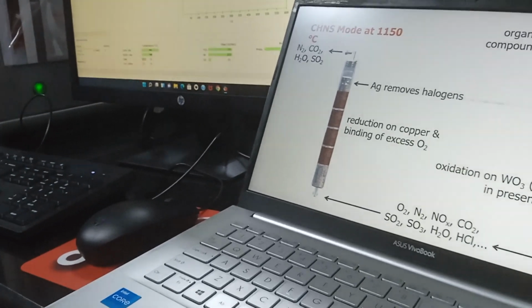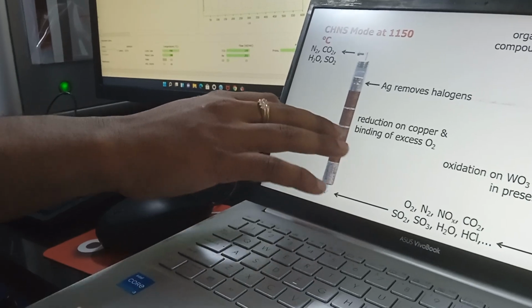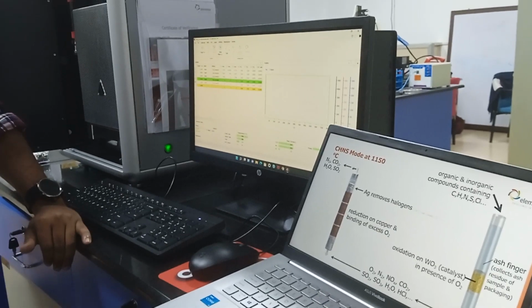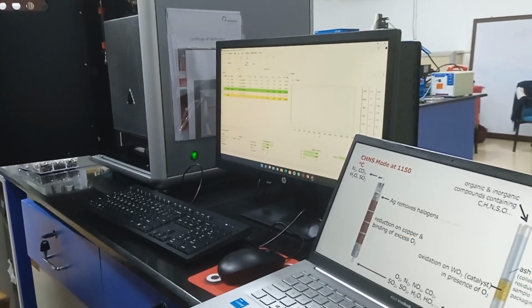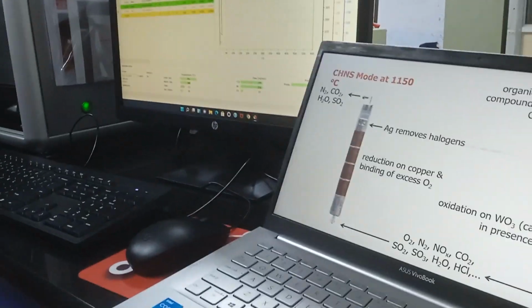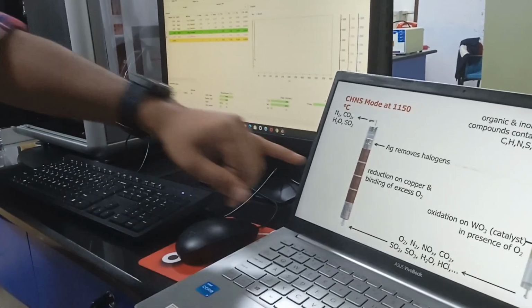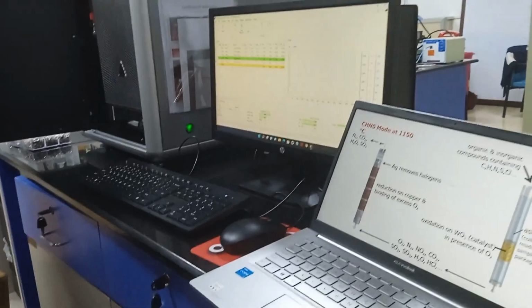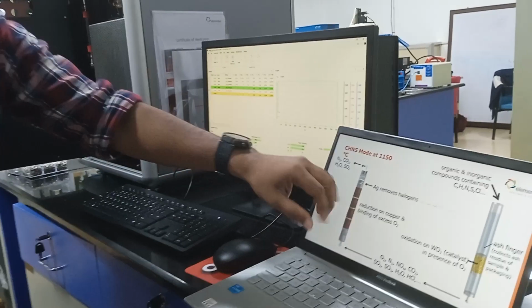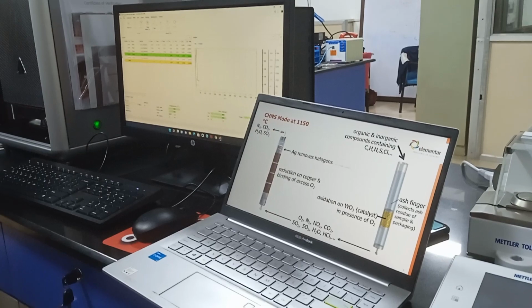And one thing: if it is consumed half, for example, and for the next time I am filling the next half, do you want to change it when I am coming for the PM? If it is consumed half, the engineer will either keep that, or else he will take out the consumed part and put in fresh material, and keep the unconsumed one at the bottom. Next he will fill the fresh one. Like that we will do.